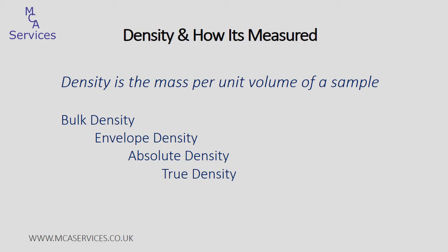At MCA, we offer several different density measurements, and we're going to show you each of these in separate videos, so please do go and take a look at them as well. But in this video, we're going to show you the difference between them and the two different techniques we use here.